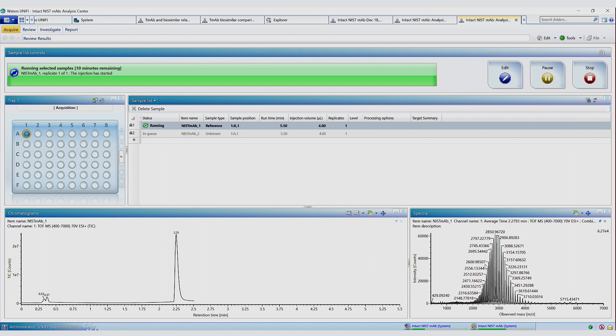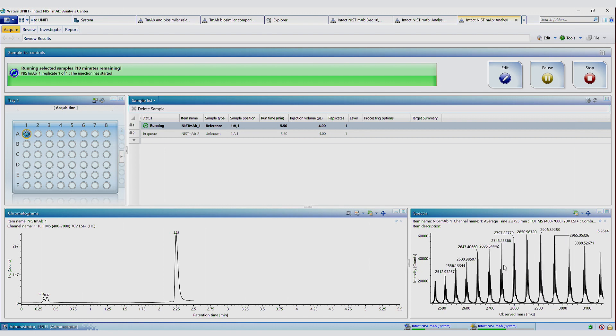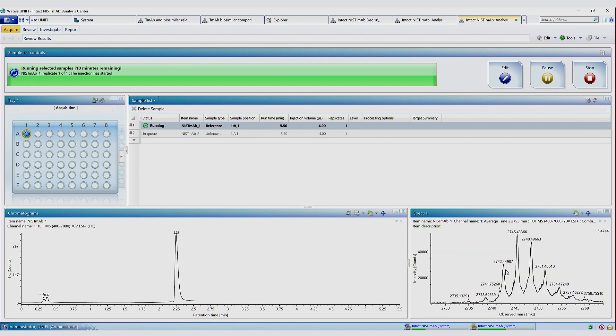So we can do a manual integration while it's running. And here we can see we have the multiply charged spectrum of the intact MAB. So we can zoom in and look at the individual glycoforms. So the software will automatically deconvolute and identify this spectrum in the processing stage, which is what we're going to look at next.